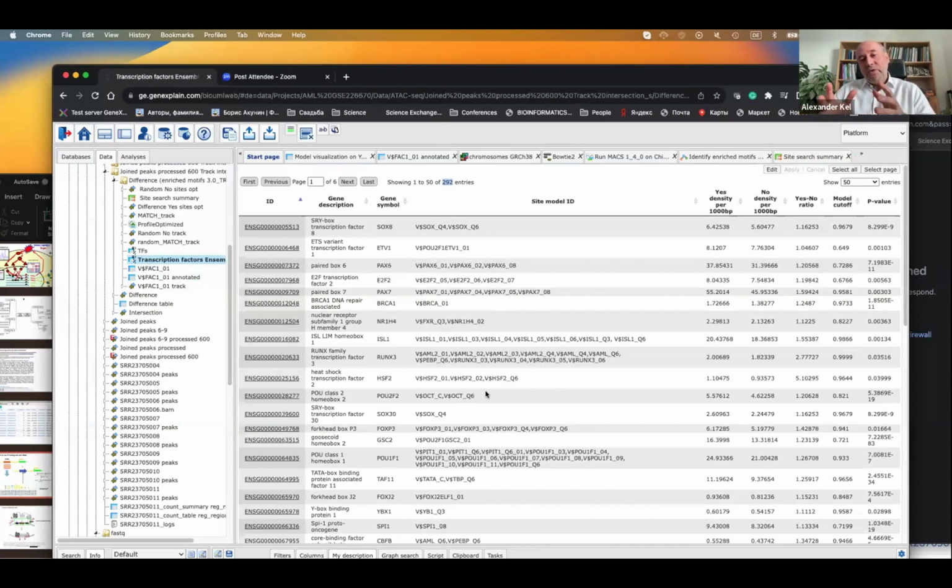But I wanted to show you a little bit of a story here, also showing the whole mechanism. I cannot go too much into details on that. I will just show you the final result. As you remember from my slides, once you found the motifs, it's only half of the story. So now you have to think how those transcription factors might be activated through maybe signal transduction pathways, and maybe you can even find the master regulators in these pathways. And that's exactly what I did.